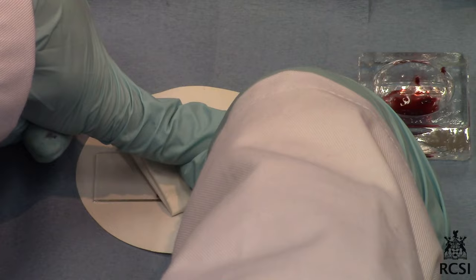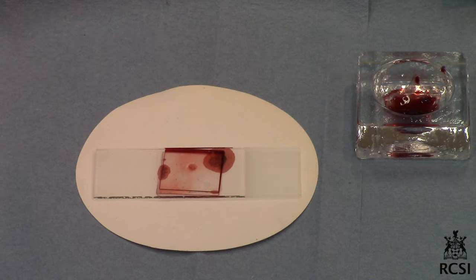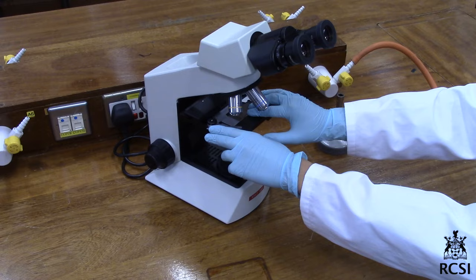Place 2-3 thicknesses of filter paper over the slide and squash firmly with the thumb. Be careful not to move the slide — an evenly distributed single layer of cells should be produced. Warm the slide over a low Bunsen flame for about 4-5 seconds. The slide should never become so hot as to be uncomfortable to touch.